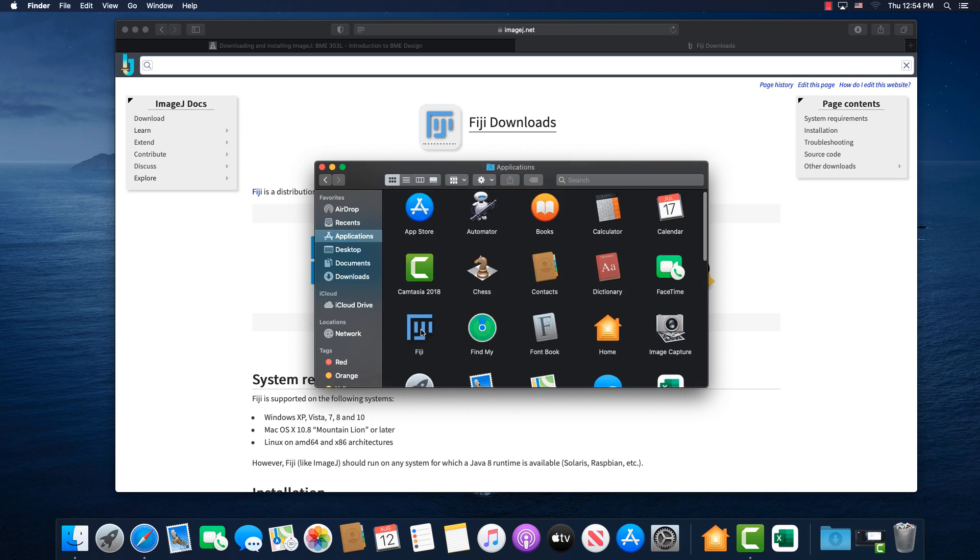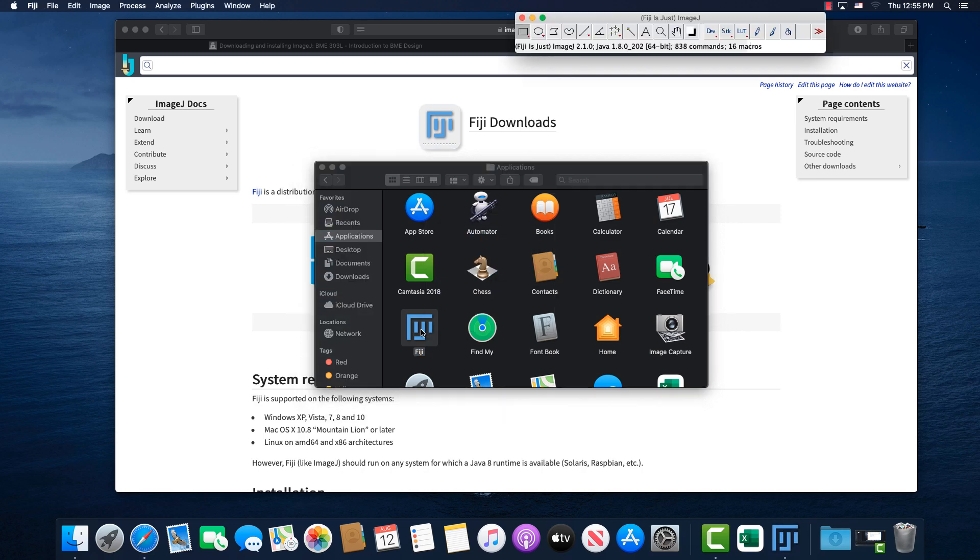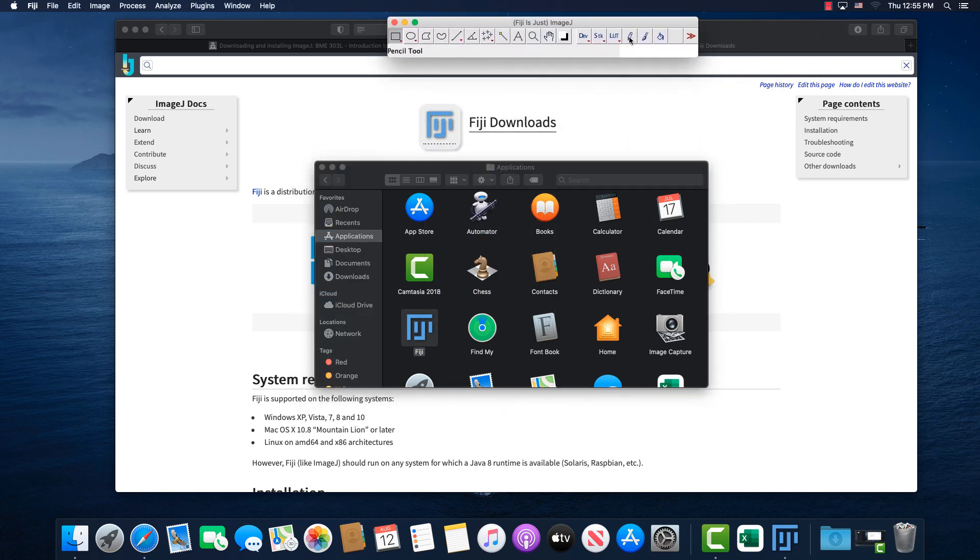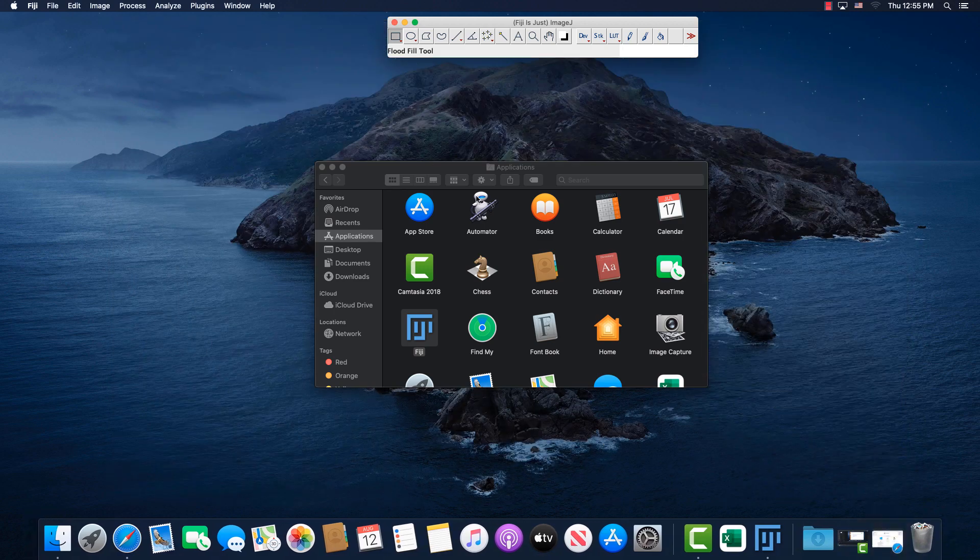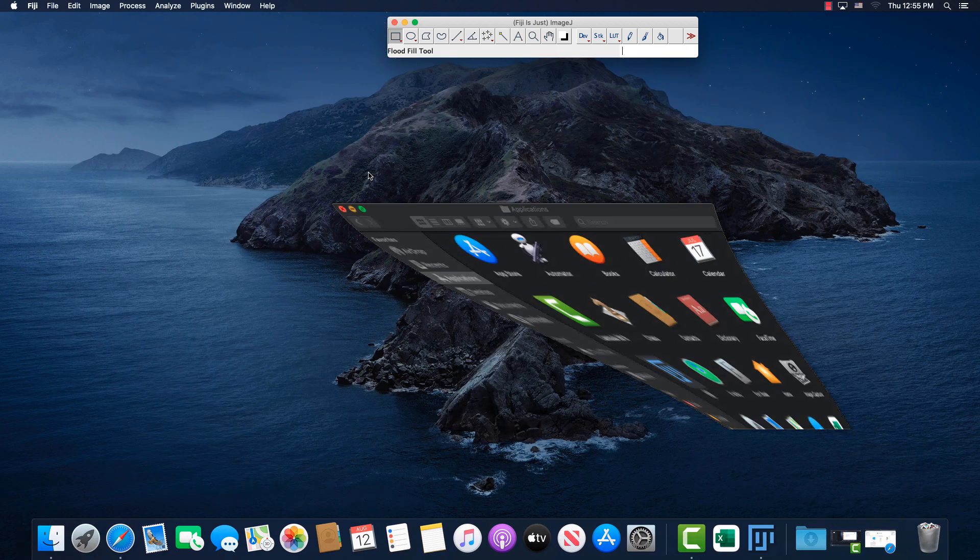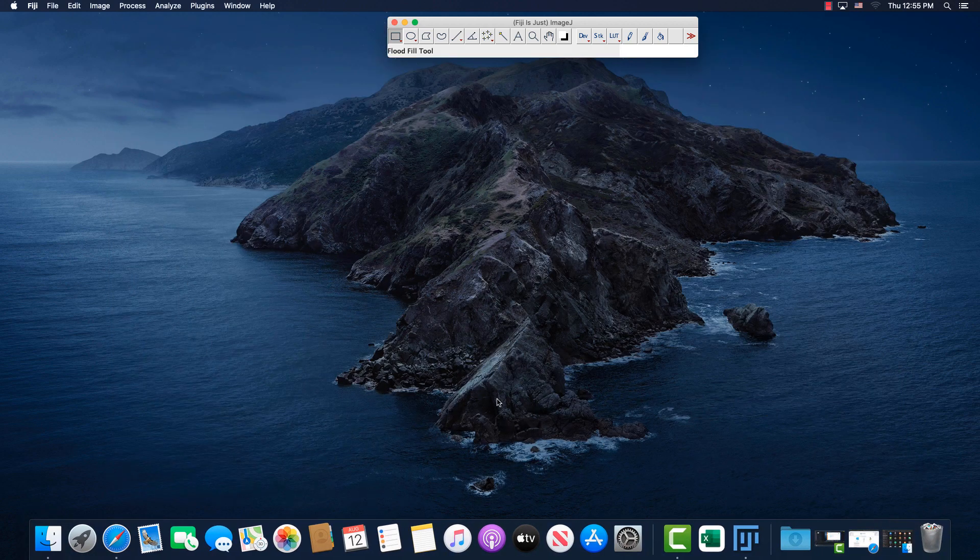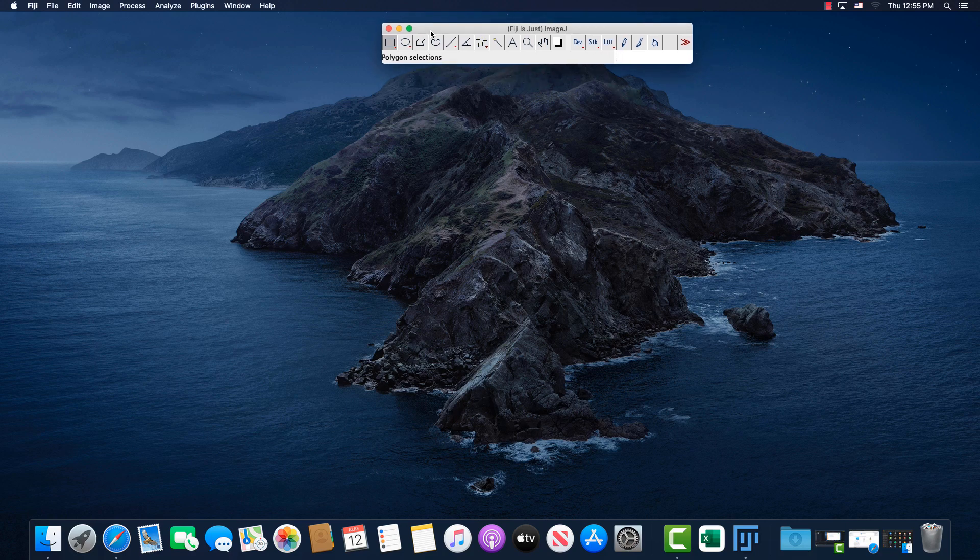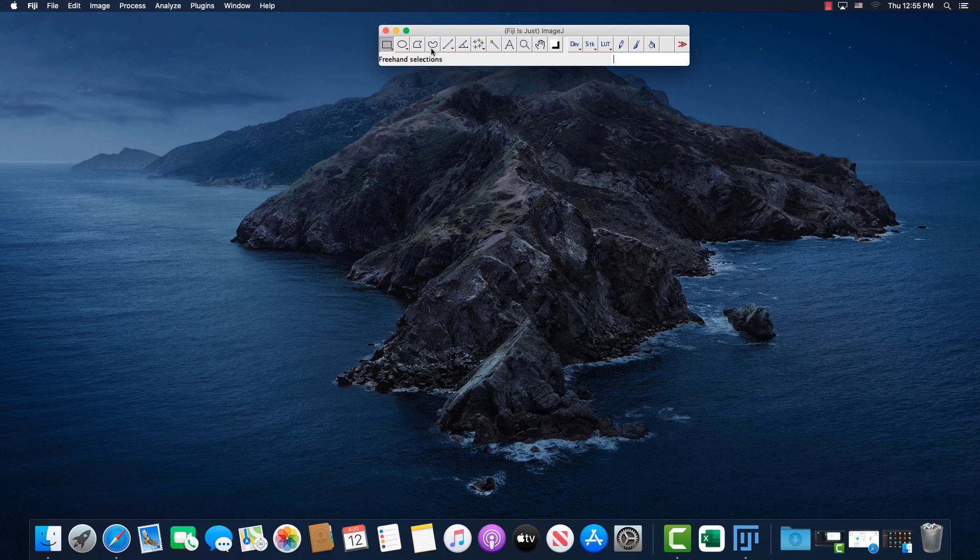And so now we can just run ImageJ from here. And so now what happens is it comes up. Usually you'll get a little box that shows, like, do you want to run the auto updater now? I previously tested to make sure it would work, and I just said no, so it didn't come up for me.